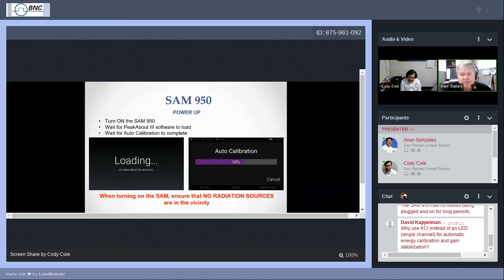I did want to talk on a topic that I will sometimes refer to as keV. That's an energy. It is an atomic energy term, and various isotopes will have certain energy amounts to them, and the gamma photons of these isotopes are referred to in a unit of keV. That's 1,000 electron volts. So it's an atomic measure of relative energies of the gamma range.